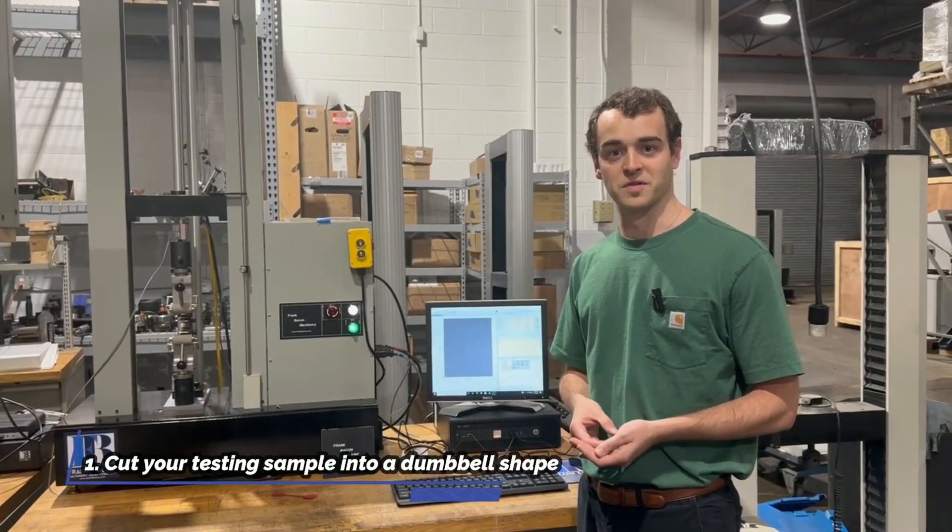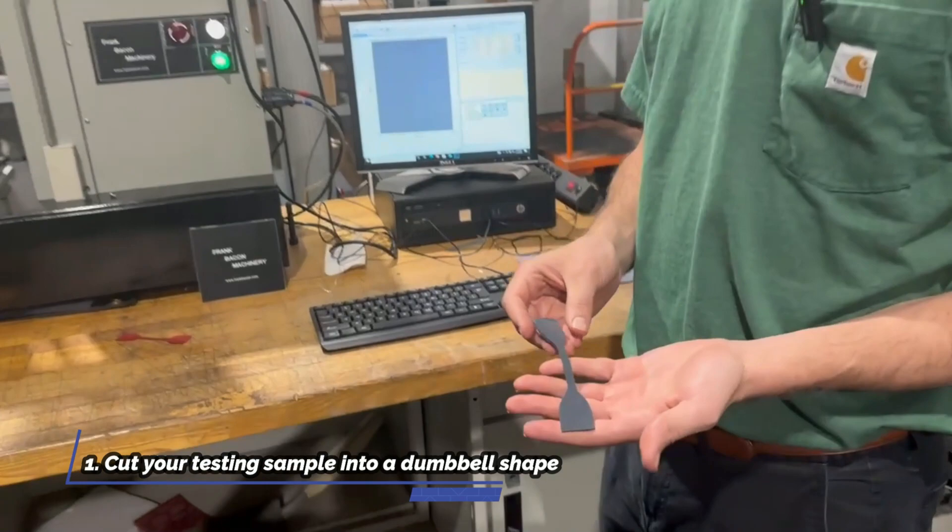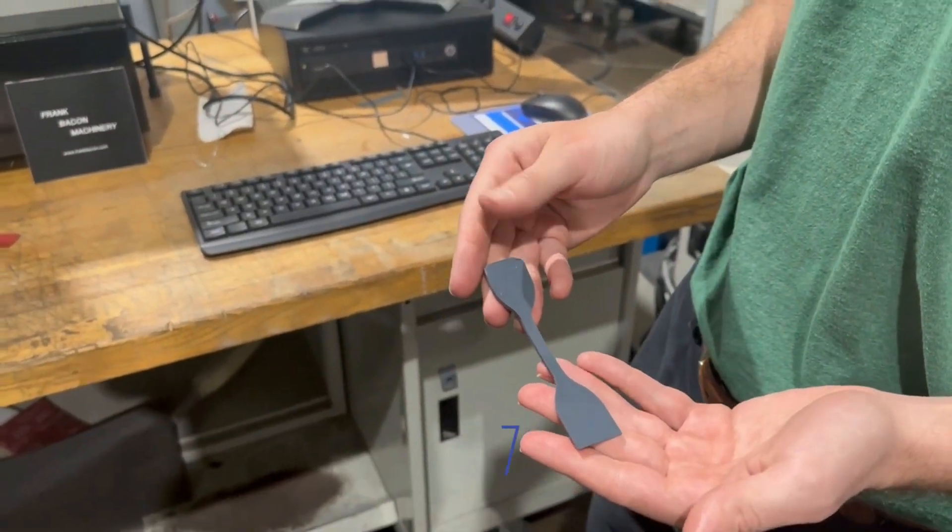Step one is having the proper sample. This is specified within the ASTM standard. Right now we've got an inch and a half gauge length dog bone sample here.